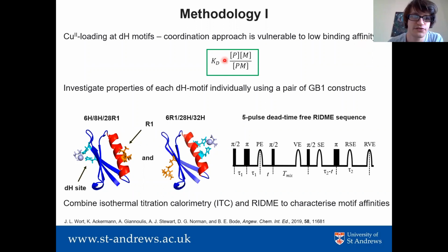And so we were interested to try and reproduce this, to independently investigate each of these double histidine motifs. And just to clarify here, when we talk about the binding affinity, we can quantify this for dilute solutions according to the expression given here in the green box.